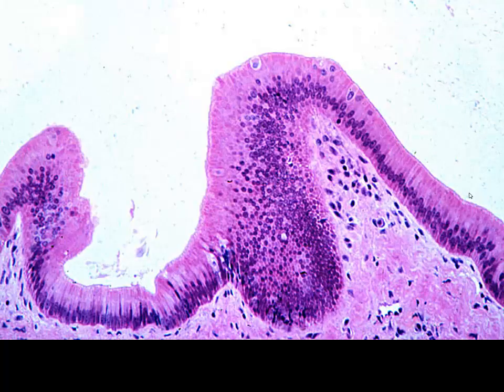With higher magnification, now we can plainly see our simple columnar epithelium. Now once again, ignore regions such as this and these tangential cuts right through where we have all of our nuclei, and pay particular attention to these nice runs where we see the single lined up nuclei. Here we can see that as well before we go back out of the plane of section. When you have a highly folded organ like the gallbladder, this kind of stuff is going to happen. So don't let this distract you away from seeing the true example of the epithelium that's present.